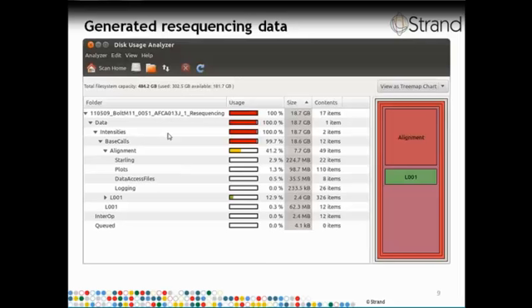We have reads which have been aligned against the individual chromosomes and the plasmids of the bacterial organism in question. We have SNP and indel results, etc. So we have the aligned read files in BAM format. We have the indel and SNP results in VCF format, and the sample name itself is present in a different sheet elsewhere in the hierarchy.